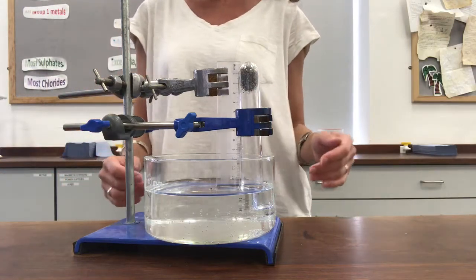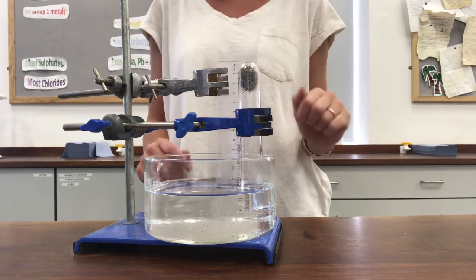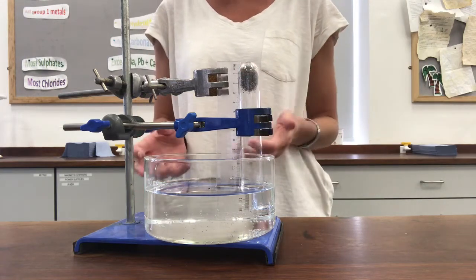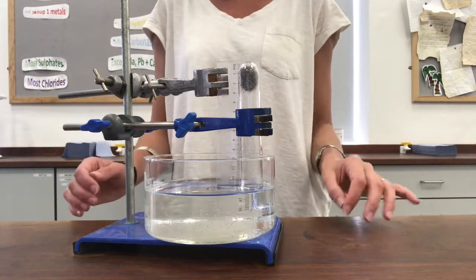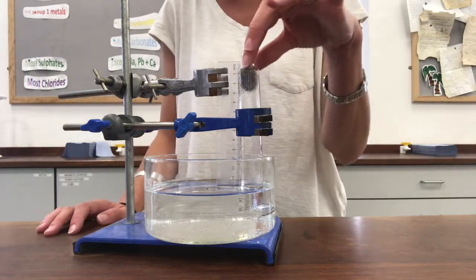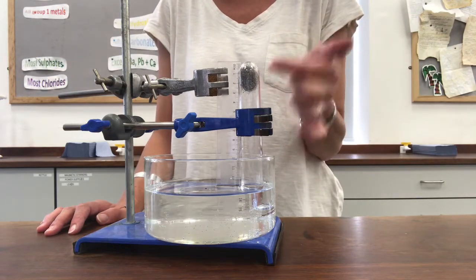This experiment uses iron rusting to prove that the percentage of oxygen in air is about 20%. What I've set up here is a boiling tube with some damp wire wool, iron wool, trapped up in the top here.